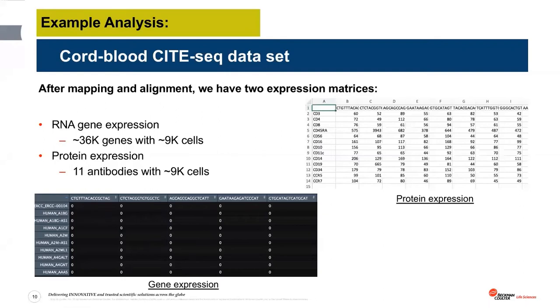And that is one of the reasons why you need to do different kinds of gene filtering to remove these low expression genes. If you don't remove these low expression genes, when you apply normalization to correct the library size effect, you will introduce noise or bias into the normalization process, and then you will end up getting low quality normalized data.